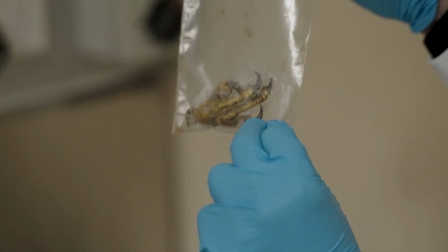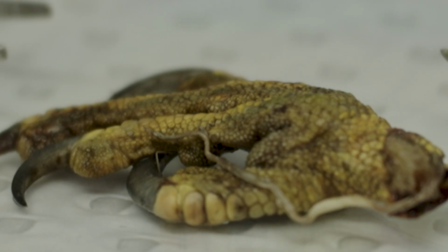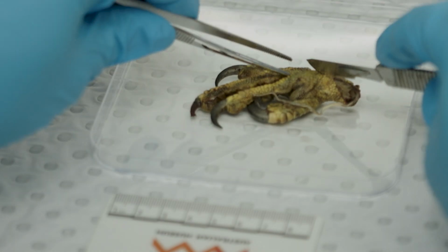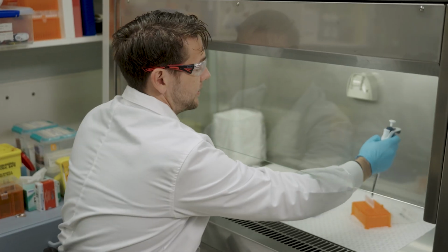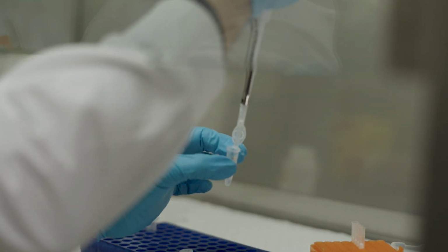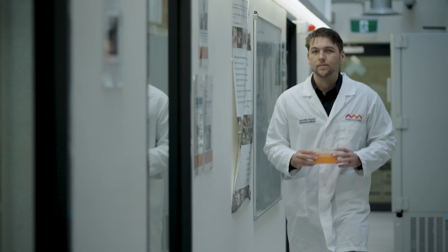Quite often what you'll get in the wake of a bird strike event is just it was a bird, which from a management perspective is not terribly useful. So this is an example of some of the biological material that we can get after an airstrike event. This is a bird talon that was recovered from the engine of a plane. It's been sent to us for DNA-based species ID. We can sequence those genes and then we can compare them to a database of known sequences to work out what animal has come into contact with that aircraft.